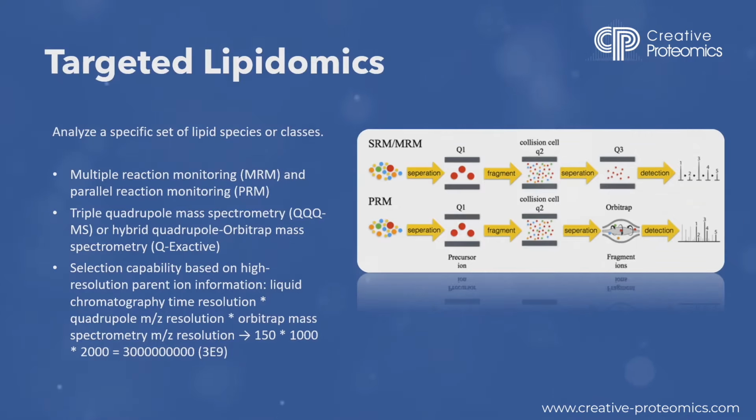The scope of targeted lipidomics is determined by the specific lipid classes or species of interest. Researchers can tailor their analyses to examine specific lipid classes such as phospholipids, glycerolipids, or sphingolipids. Furthermore, within each class, targeted lipidomics can provide insights into individual lipid species or their specific modifications, such as fatty acyl chain length or degree of saturation.